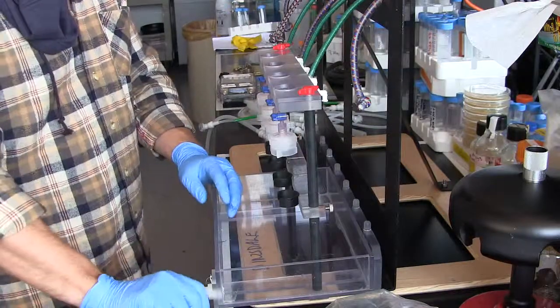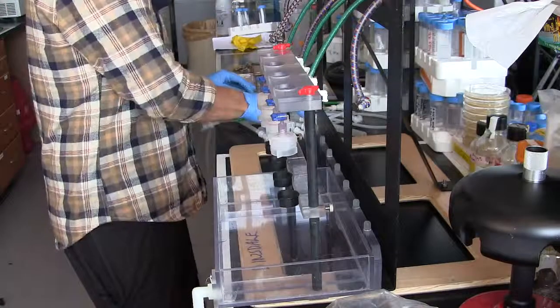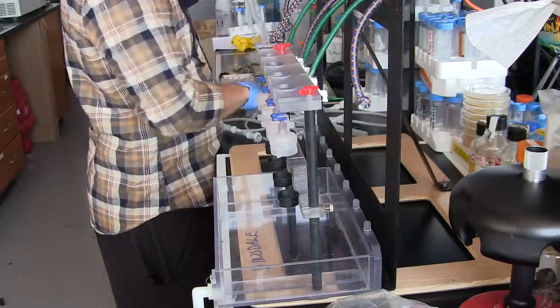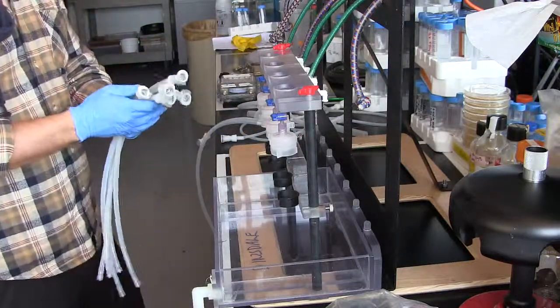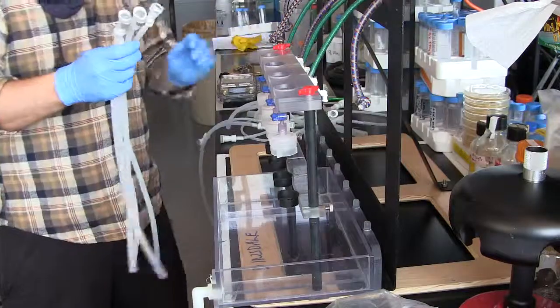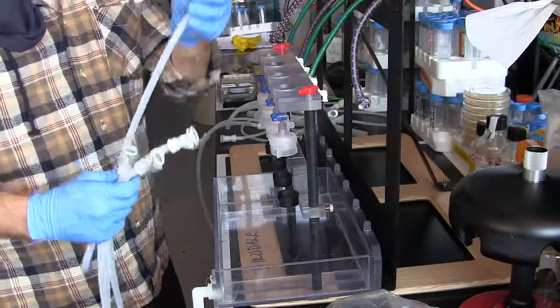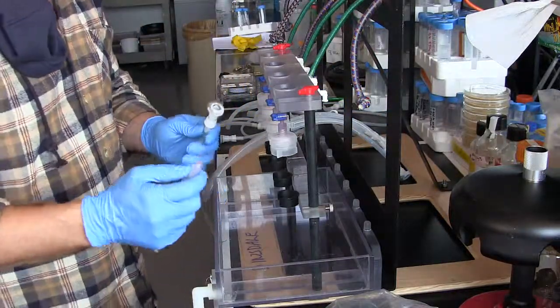Normally you would put some tubing onto this to run it to a sink if you want to drain to a sink. Alright, the next thing we want to set up is what goes between the Niskins and the water chemistry, the water flowing area here. For this we have 4 hoses that have a petcock at one end, and then they have a luer lock fitting at the other end.